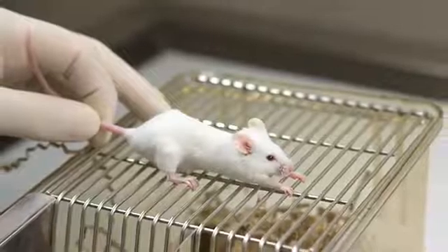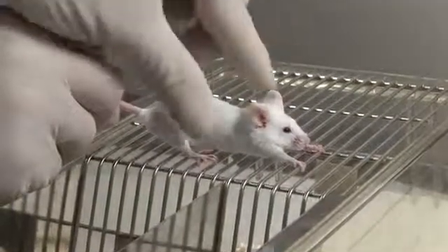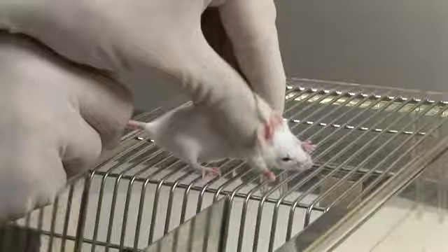Pulling back gently will cause the mouse to grip the bars of the cage lid with its front paws. Using the forefinger and thumb of your second hand, draw up the loose skin from over the shoulders and hold securely so as to restrict movement of the mouse's head.